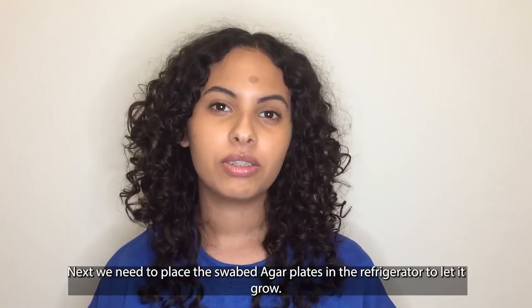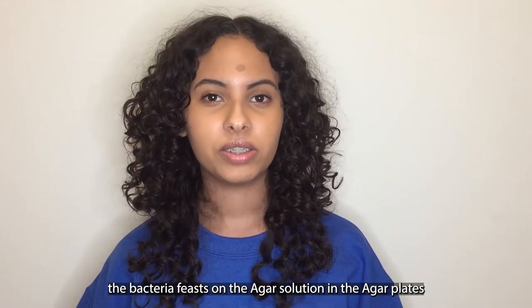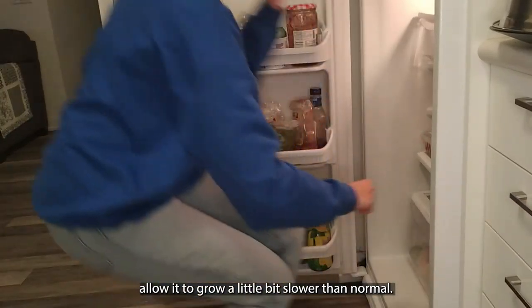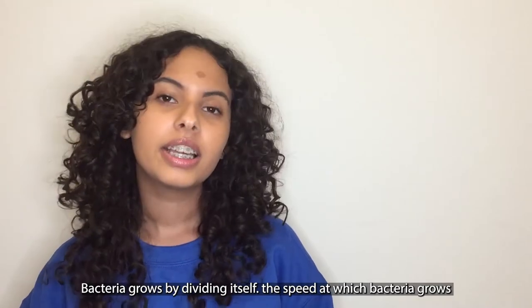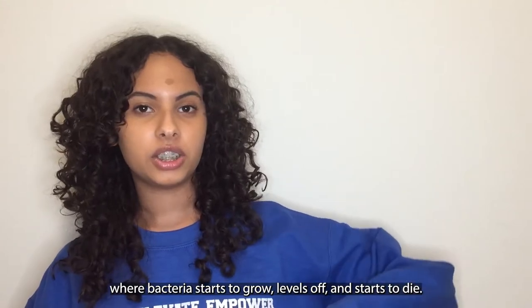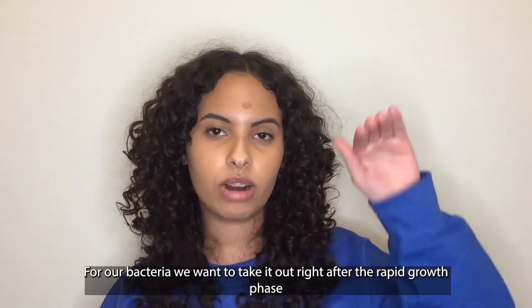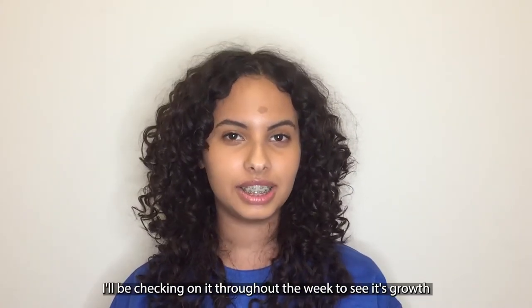We have to put the swabbed agar plates in the refrigerator to let the bacteria grow. The bacteria feasts on the agar solution in the agar plates, providing it food and shelter to grow. Refrigerating the agar plates allows it to grow a little bit slower than normal. Bacteria grows by dividing itself. The speed at which bacteria grows is modeled by the bacteria growth curve — bacteria starts to grow, levels off, and then starts to die. For our bacteria, we want to take it out right after the rapid growth phase, so once it hits that peak, I'll be checking on it throughout the week to see its growth.